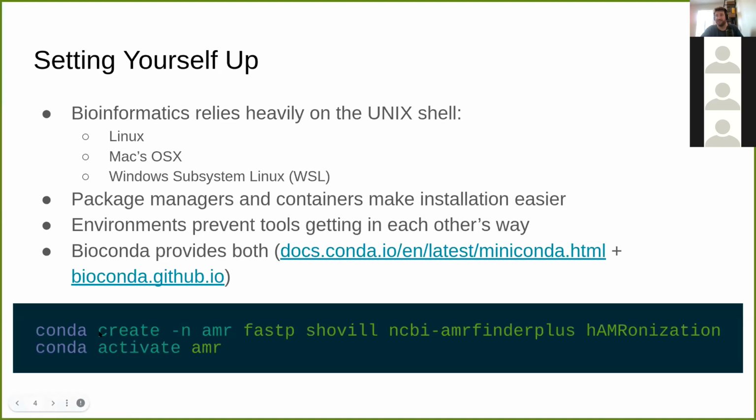What this means is once you've done that, you have this nice feature where you can just type conda create, name an environment, and then just name the bioinformatics tools you want to install. And then it'll just run through that. It'll install all those things for you without much need of complexity or difficulties. And then you can just open that environment with conda activate AMR. And again, if it's going too fast, you can go at your own pace in the README.